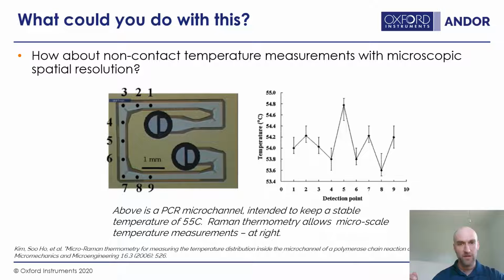But if you can do water, well, the water's already there. Let's measure the Raman spectrum of water. So what they do is they aim their beam around here, their optical probe, and they look at the temperature here, along that track. And they can actually indirectly measure temperature variation.